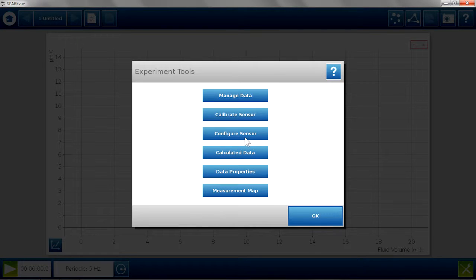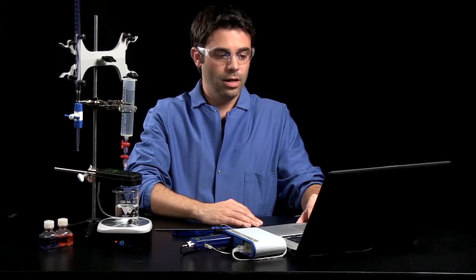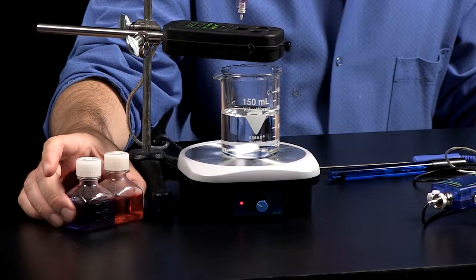You can calibrate your sensor. In this case, I can calibrate my chemistry sensor and my pH. Now I already pre-calibrated this with my buffers 4 and 10.